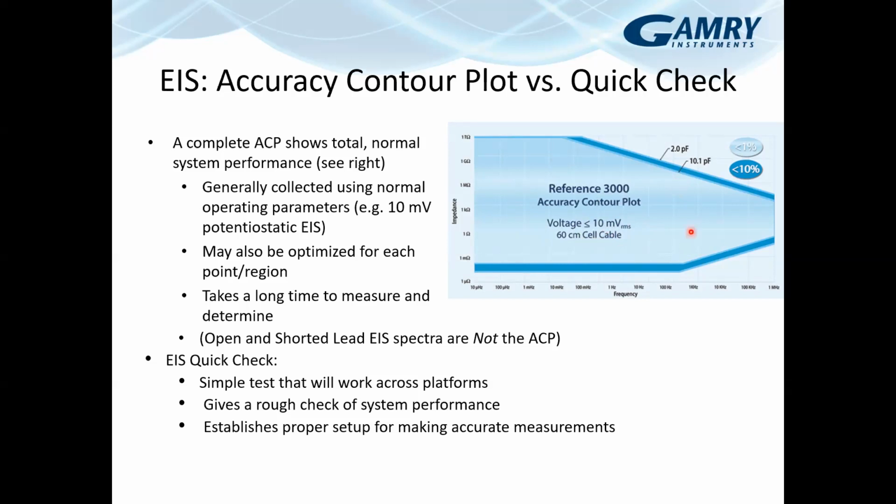The other thing is that collecting this takes a long time. There is a shortcut to this: open and shorted lead. These are not the same thing as the accuracy contour plot, but I will show you what they are and how to run them, if you're interested, shortly.